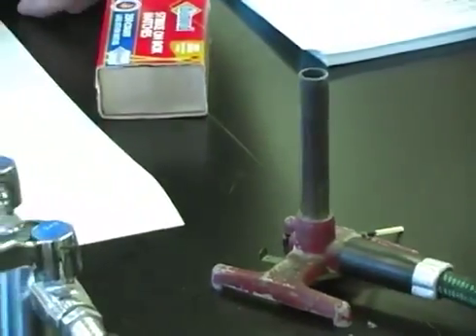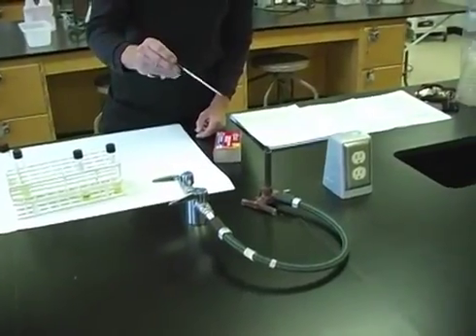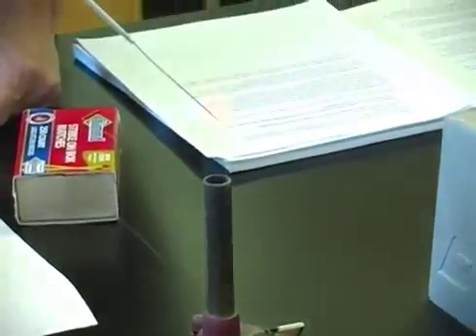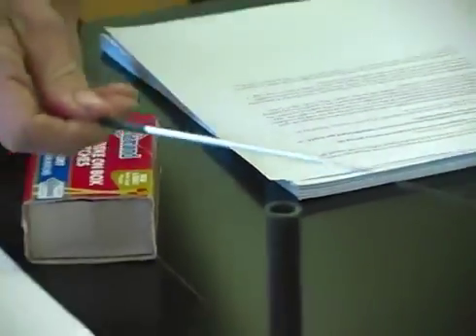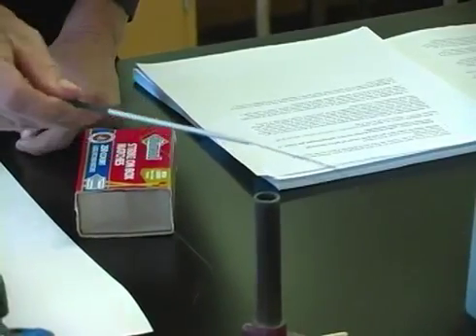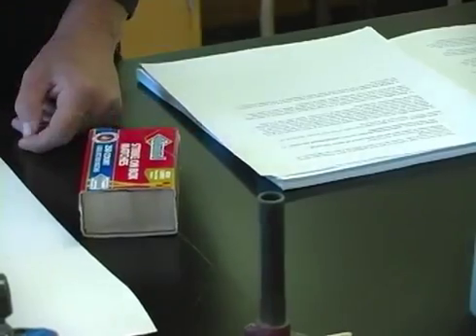I'll then sterilize my inoculating loop, killing all contaminating microbes, by holding it in the Bunsen burner flame until the wire becomes red hot. I slowly flame the entire length of the inoculating loop, and in addition, I'll lightly flame 1/2 to 3/4 of the wire handle to decrease contamination with environmental microbes.